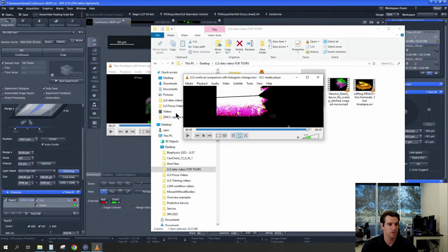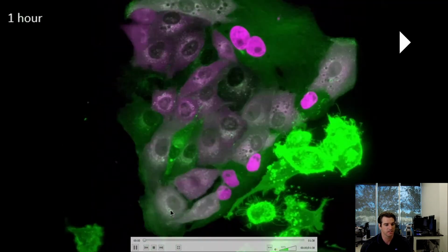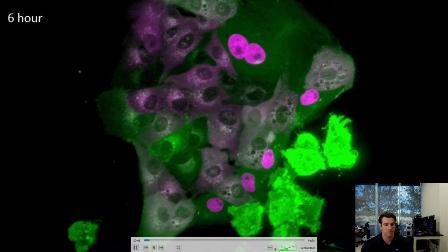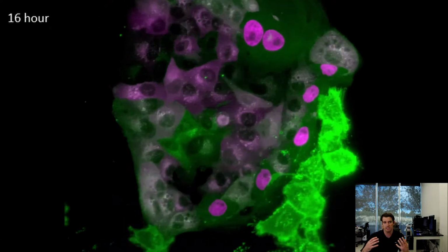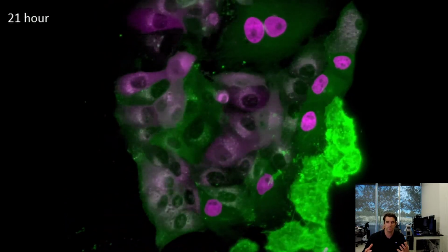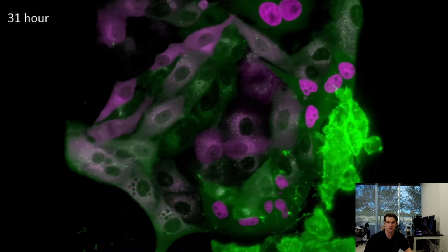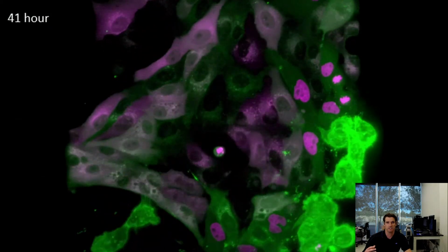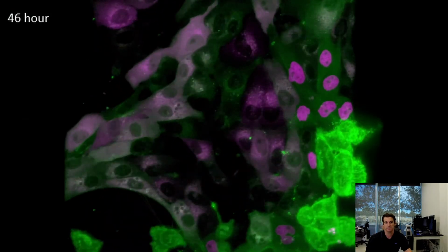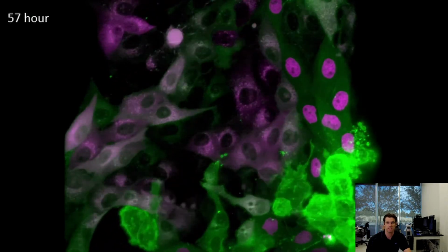So another one that's a little bit more in line with what we talk about for the system is, let's take a look at this time lapse looking at some cell culture. So this is me experimenting with very, very long time lapses because when we first released this system, we'd always get the question of, well, how long can I image? And I hadn't done that personally. I hadn't tested it.